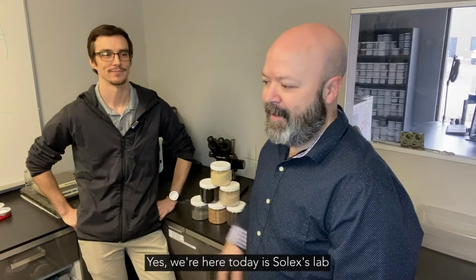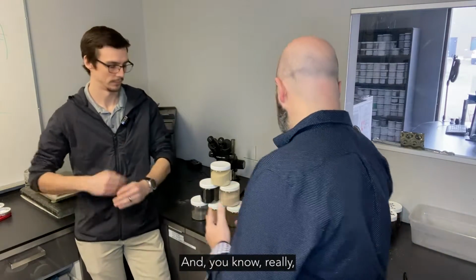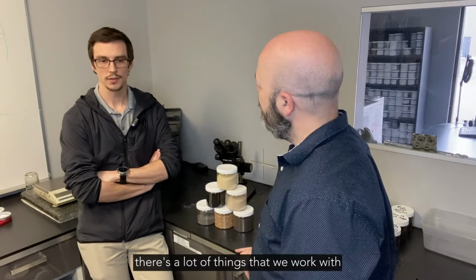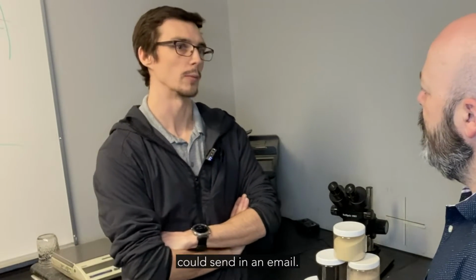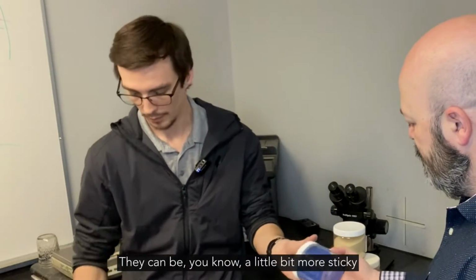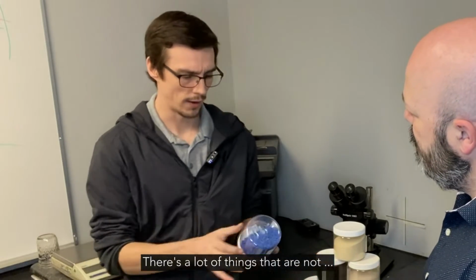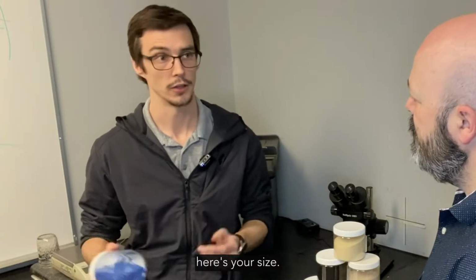Yeah, we're here today in Solex's lab in Calgary, Alberta, Canada, and we're going to talk a little bit about lab testing and, really, why do we lab test? Why is it important? We lab test because there's a lot of things that we work with that are very difficult to define in a way that you could send in an email. Bulk solids, they vary tremendously. They can be really fine, very flowable. They can be a little bit more sticky. Water can be involved. It's not a fluid where you can give me a viscosity and a couple other parameters and I could say, here's your size.